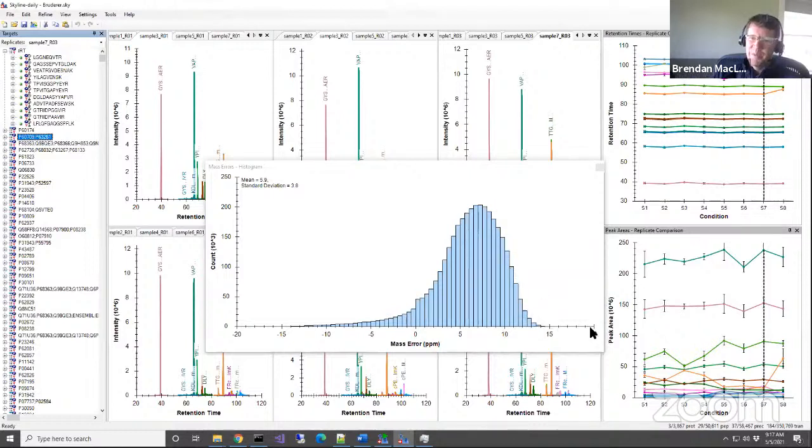So there might actually be more tailing out here than we're capturing, although it does just come right down. So we're not way off. If you saw something that looked like a Gaussian that was cut off by the histogram, then you would really feel like you were way off. Like if we had chosen, say, 10 ppm, you can imagine that I would have a very steep drop off on the right side.